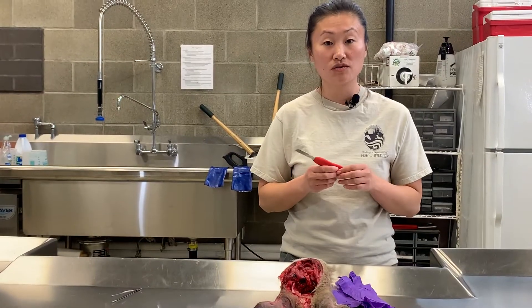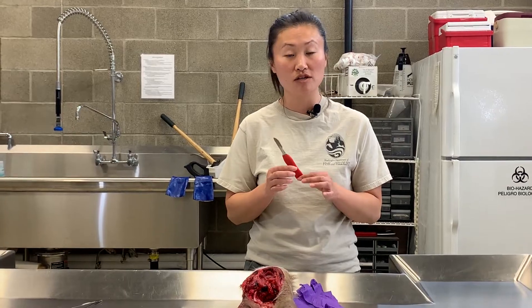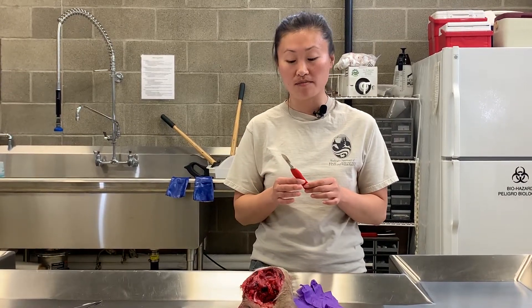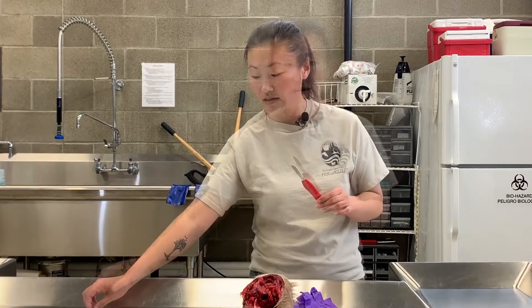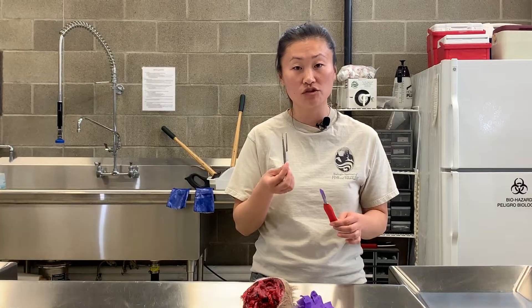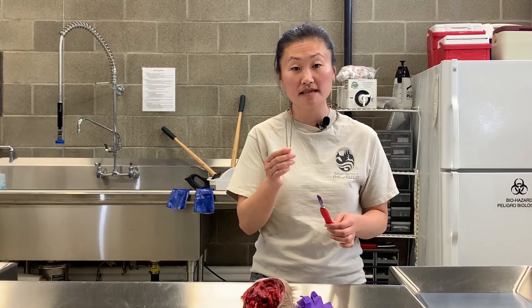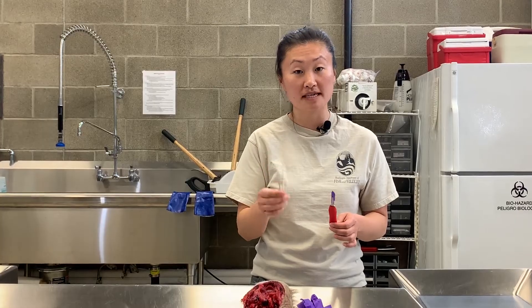You can use any sort of knife — here I'll be demonstrating with a scalpel, but you can use your hunting knives. Any sort of knife is perfectly fine for this. I will also be using forceps to help me grab the tissue, but you don't need this tool. I'm going to use it so that you can see exactly what I'm doing.